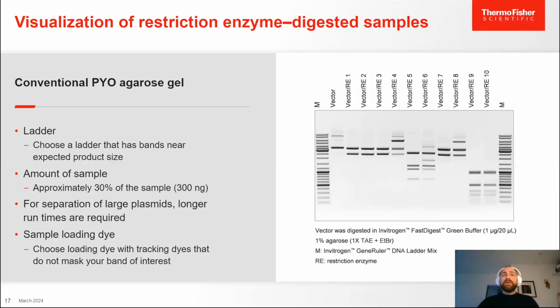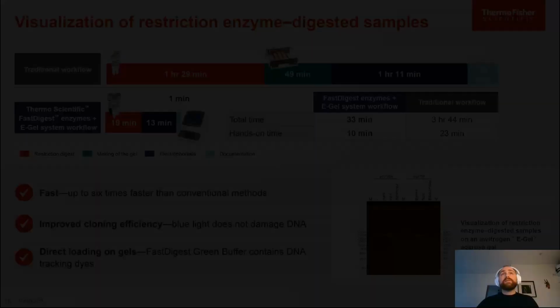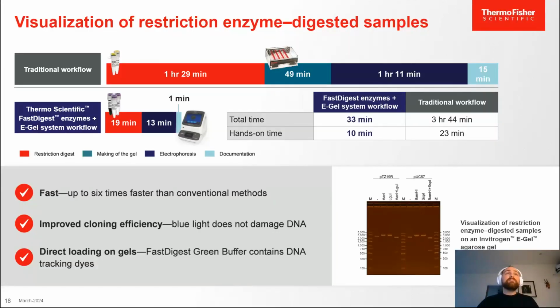Sample loading dye is another thing to consider. Sometimes sample loading dyes can move and overshadow, but I'll show some examples later on of how this can look in troubleshooting specifically. Of course, if you're using e-gels, this whole process becomes much simpler.